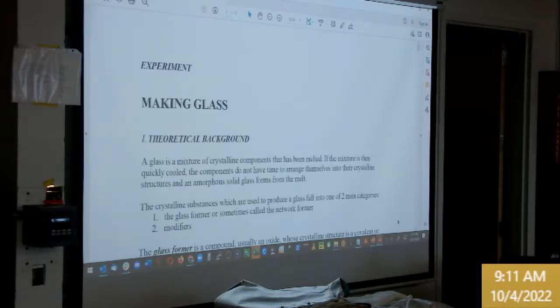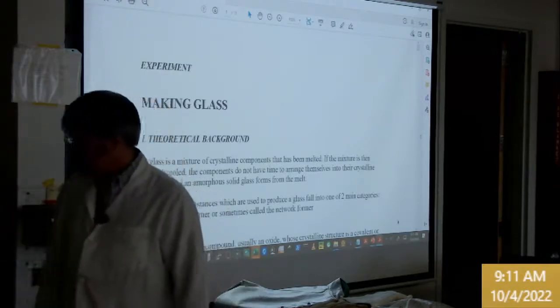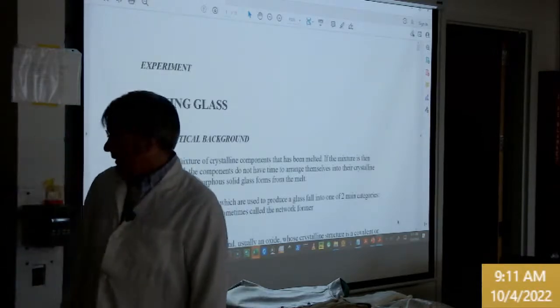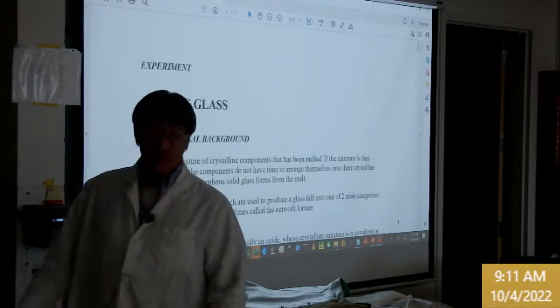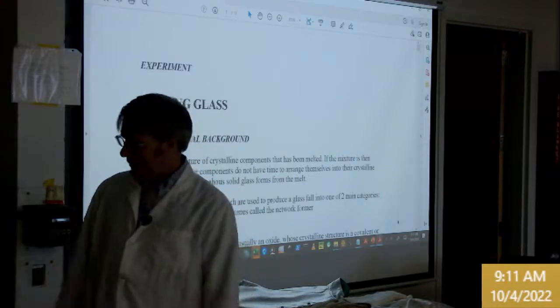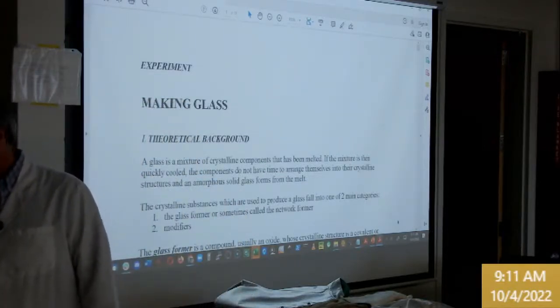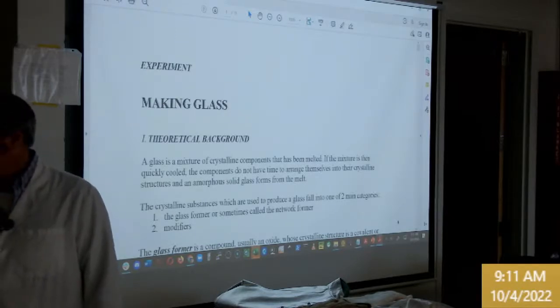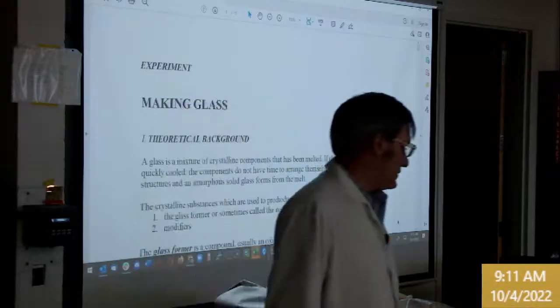What I noticed in the spring was that our glass looked a little bit more viscous than it did the previous years. We recently transitioned from this furnace, which you can see is battle tested. It's got some heating element issues and I can't find replacements. So I'm either going to have to scrap it or make my own elements. I usually like to have some backups, which is why I'm still thinking of that one. But still dialing in that temperature. So we're going to bump that up. It should be ready to go here in a few minutes.